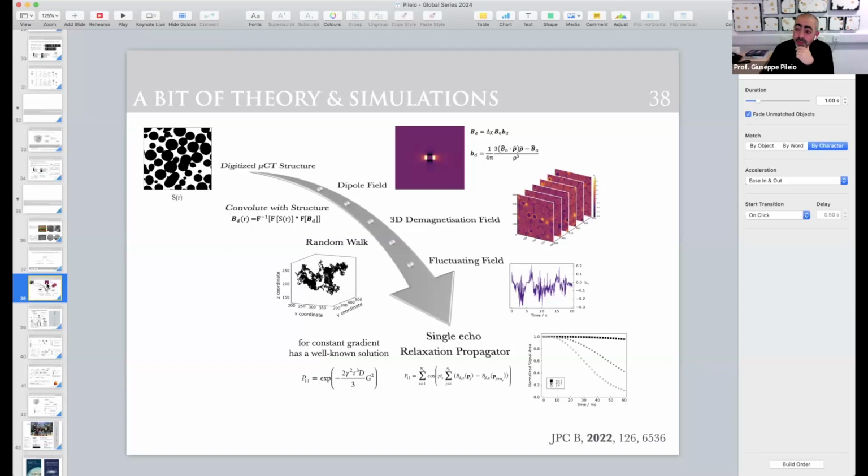Yes, great question. Hi, Florian, by the way. So what I plot here is in fact the fluctuating field against time, across all trajectories. The trajectory is actually 20 seconds, so you see the molecule goes everywhere. But actually what we have is a vector which contains the position of the spin at each time. So the molecule goes and hits the walls and reflects back as well, so we have all sorts of sensitivity to the location.